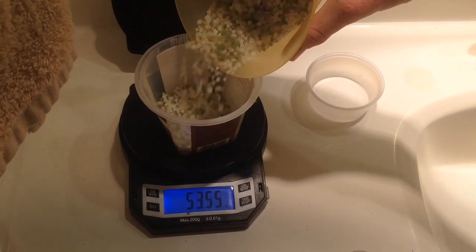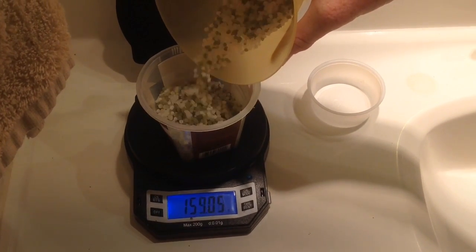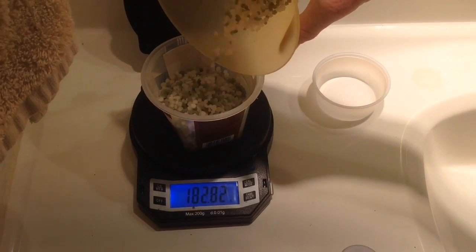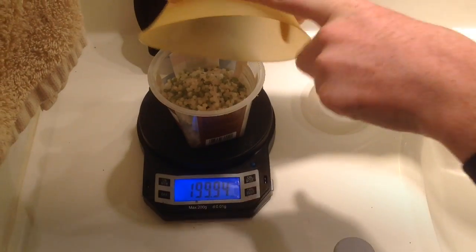Right here is the fertilizer, and you can see there are two parts: green and white. The white is the ammonium sulfate and the green are the impurities. For this reason, I weighed out 200 grams because I only wanted to recrystallize 100 grams of the ammonium sulfate.